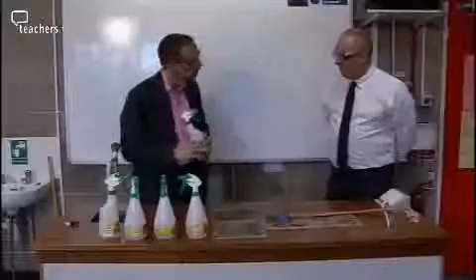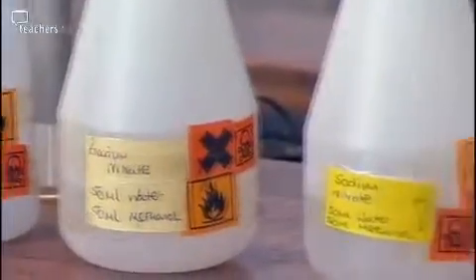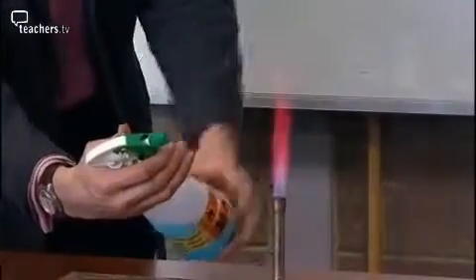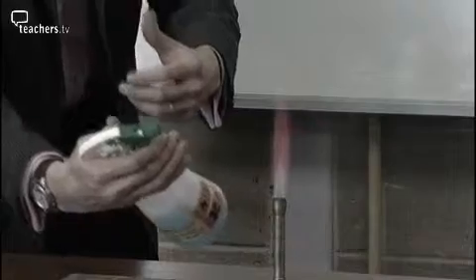We've got a 50-50 mix of water and ethanol in here and we've added our metal salt. This is a little bit like a flame thrower if you like. We're going to spray our mixture across the flame and we should get a nice puff of colour. There we go — beautiful, really nice, and it's quite wide. Very visible. And it's going to keep our bunsen nice and clean.